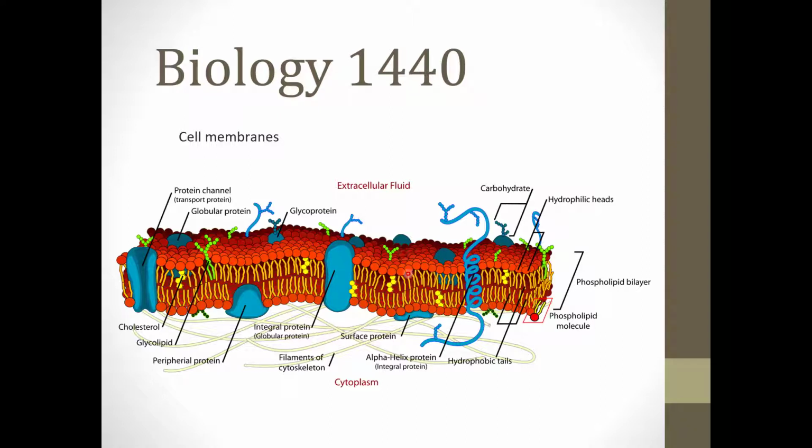could measure that damage. And cell membranes are composed of a phospholipid bilayer with proteins embedded within, and you'll learn more about that in a lecture. But it's something worth studying. And we're going to be using beets, garden beets, as the organism in our experiment.